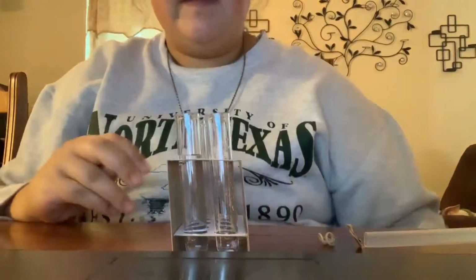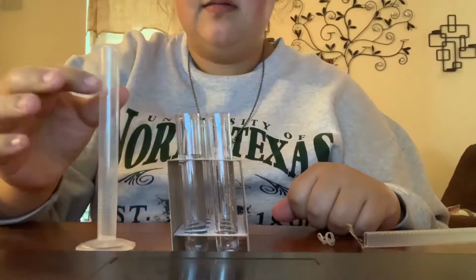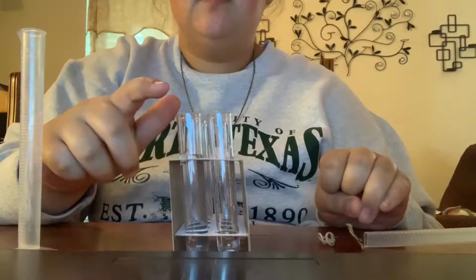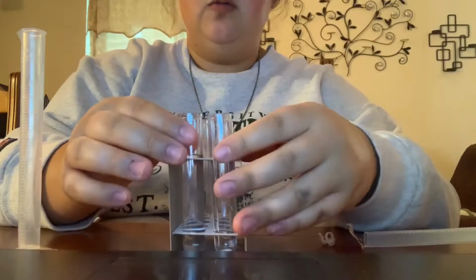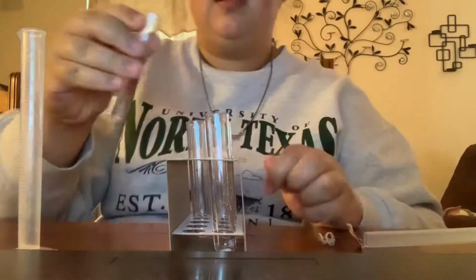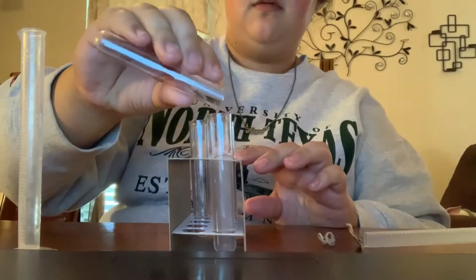I have recorded all the data for activity 1, and now starting activity 2, I used 10 milliliters of water in this tube and 0.3 grams of the sodium polyacrylate powder in this test tube. So I'm going to mix them together now. Oh, and I've pre-recorded the before stuff. Cool.